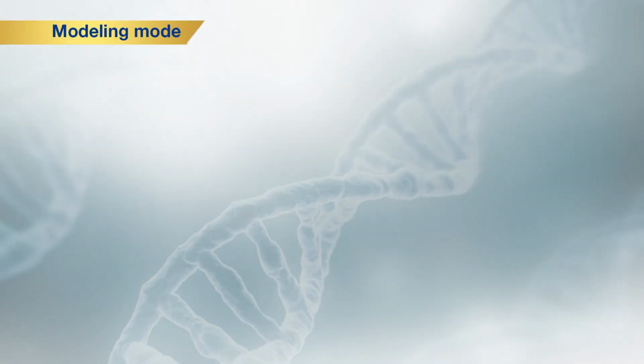Typical runs require on the order of 1 hour depending on server load, as it is a server-based online tool. So, it requires an input of structure and sequence to initiate the process. After input, we have to select the modeling mode.